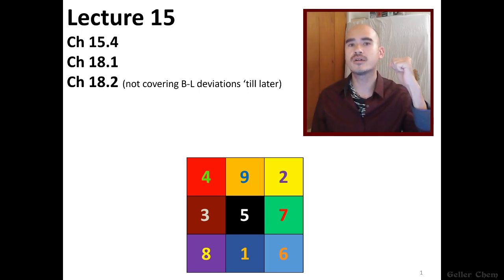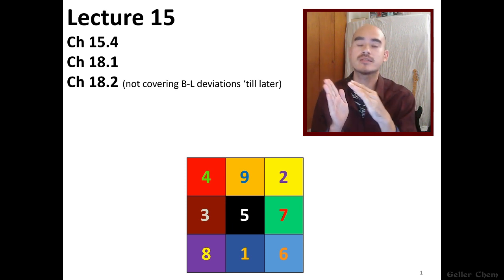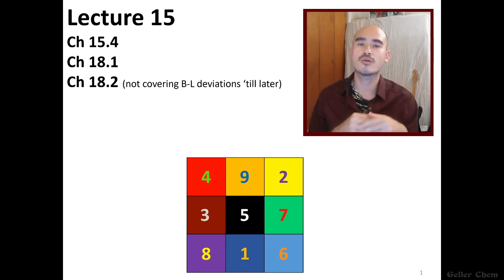Okay, today we are going to finish electrochemistry and then make a decent amount of headway into our next major unit of this course. But first, just to remind ourselves, last time we finally got into how electrochemistry is used analytically in the form of this device called an ion-sensitive electrode, or ISE for short. And the type of ISE that we are focusing on in this class is the pH probe, which is one of the more common ISEs.